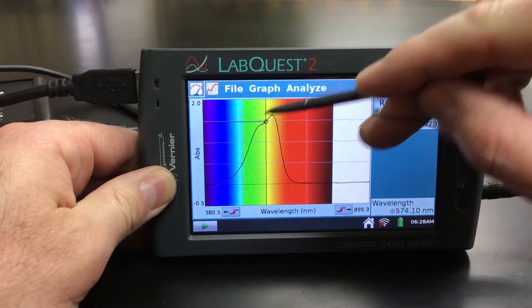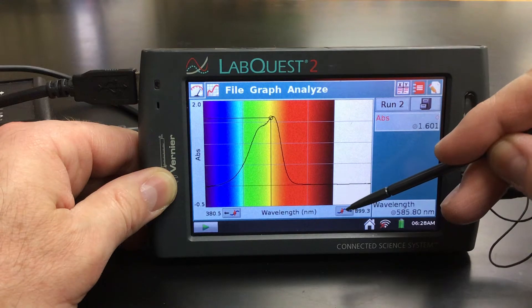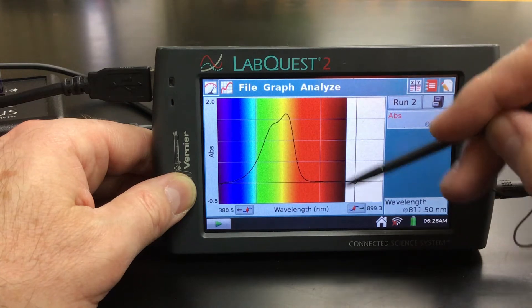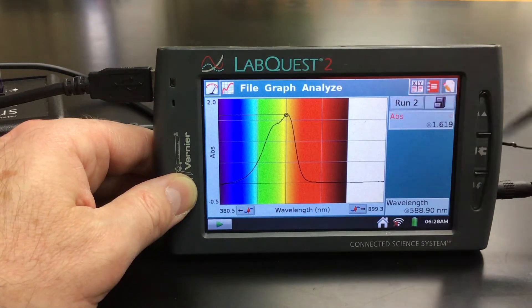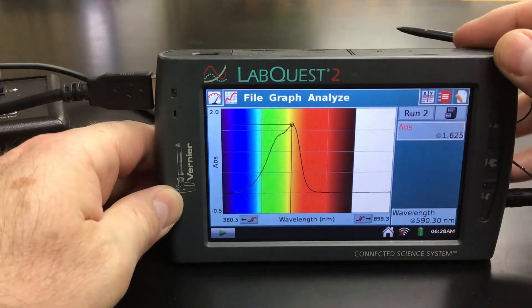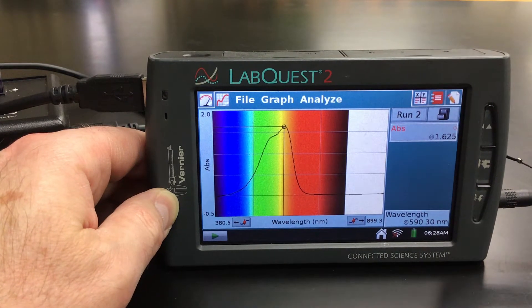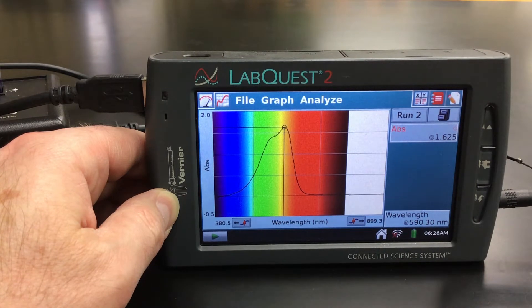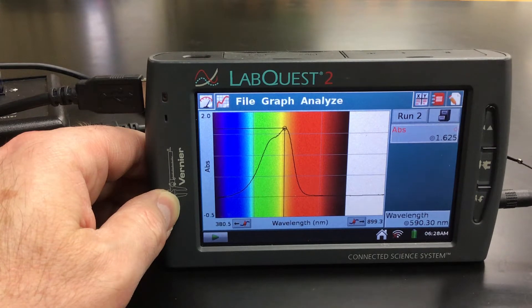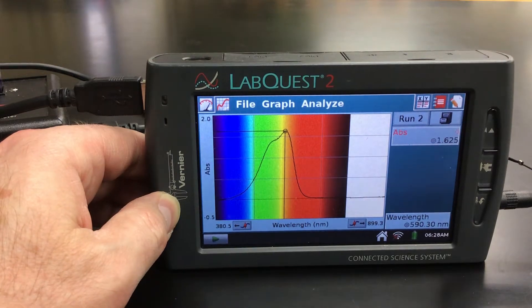So let's estimate where that is. At 574, I'll use my little buttons here to get to about 590. That's pretty close — I might go a couple more. Now, even though you see the absorbance as over one, that's going to be OK, because when we mix our Crystal Violet with our sodium hydroxide, the solution is slowly going to go to colorless. And so the wavelength that actually collects that is going to be less than one and then going down to zero.